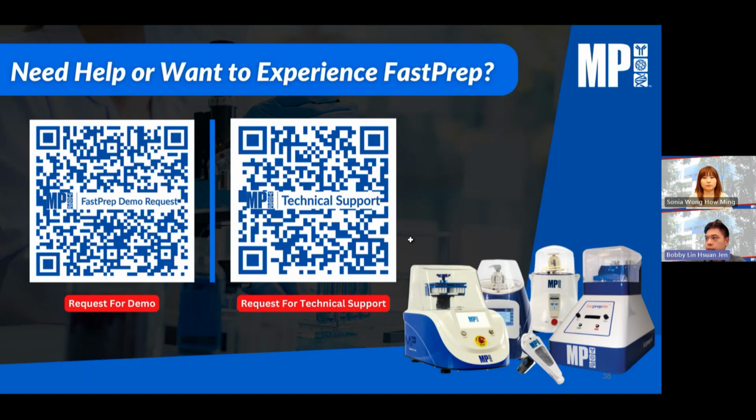She's also asking that she's been using SpinEasy RNA kit for bacteria, but she keeps on getting a very degraded and minimal RNA. So how can we troubleshoot that? Her sample type is gram-negative cell, like E. coli, incubated in minimal media and chitins.